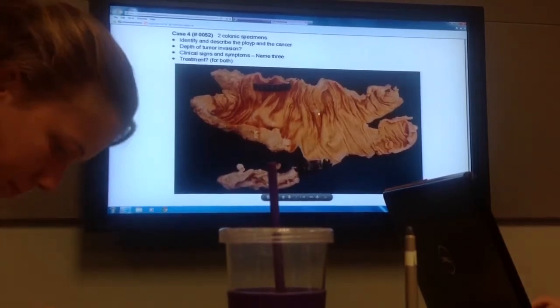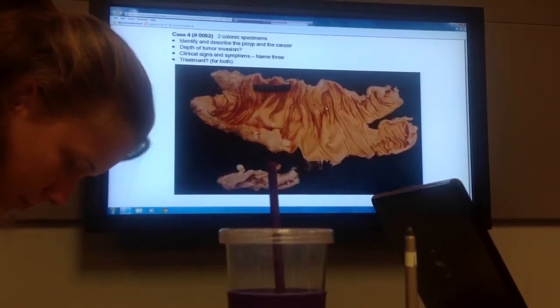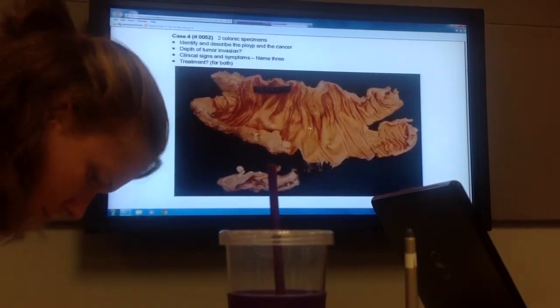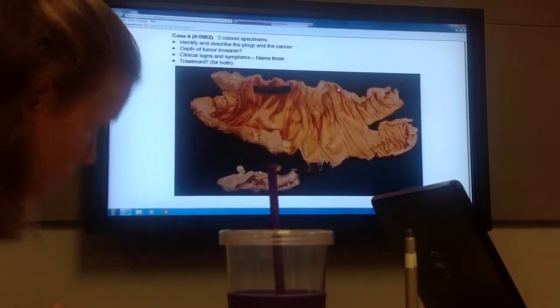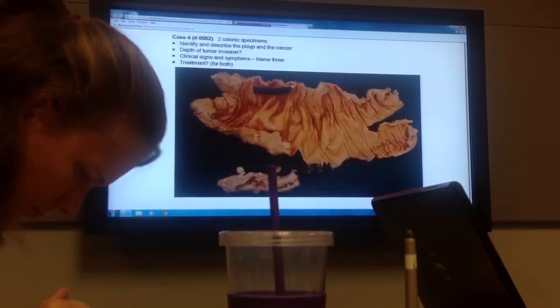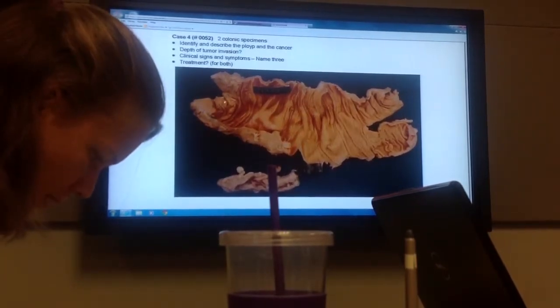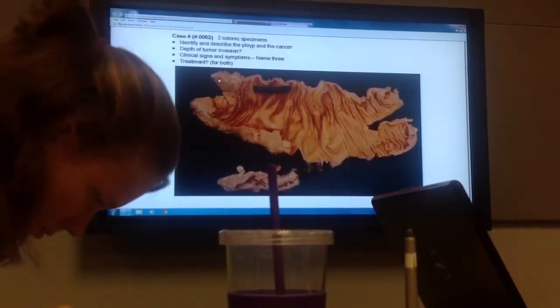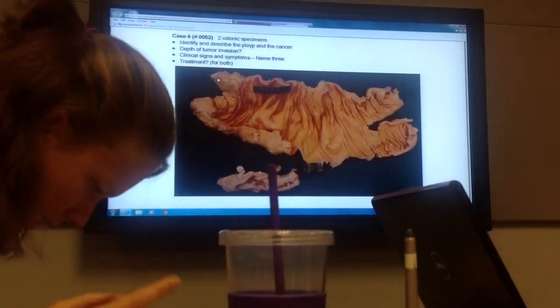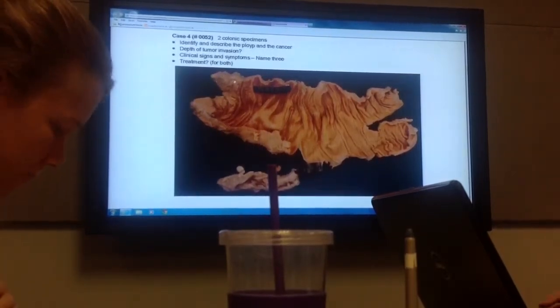Okay. So then here's the mucosa. And this is pretty kind of normal for a fixed specimen, the color. And the pattern of folds is pretty normal for a fixed colon. And then you look up here at the wall, and it looks pretty much nice and thin, not too thickened or anything. Then you come down here, and what's this? It's been cut into, so it's kind of splayed out. It's kind of like opened up. But it looks like this edge used to be over here on this edge. So this is the thickness of the wall.